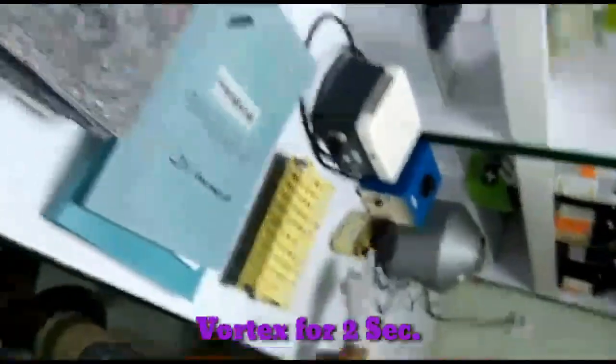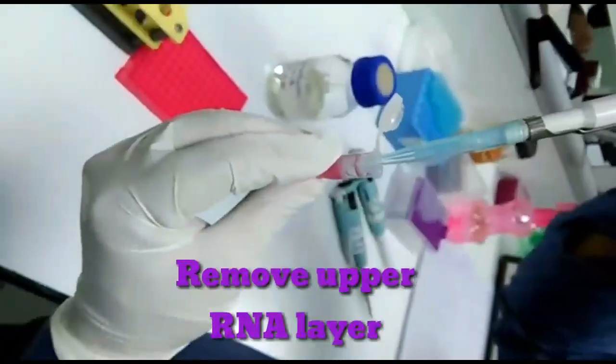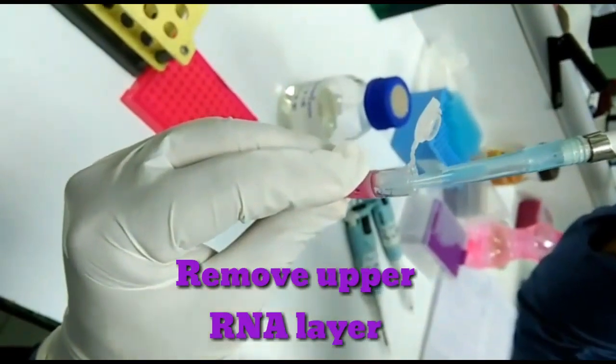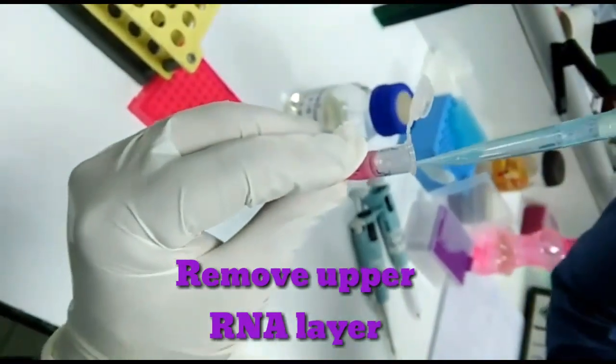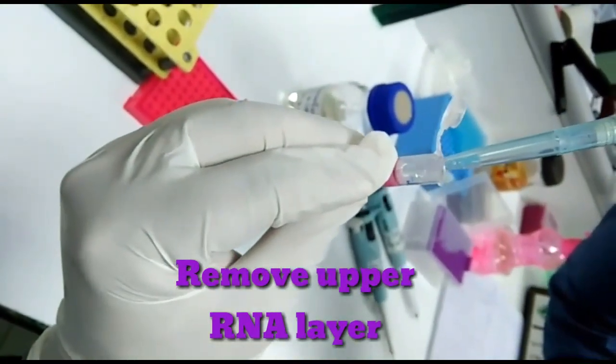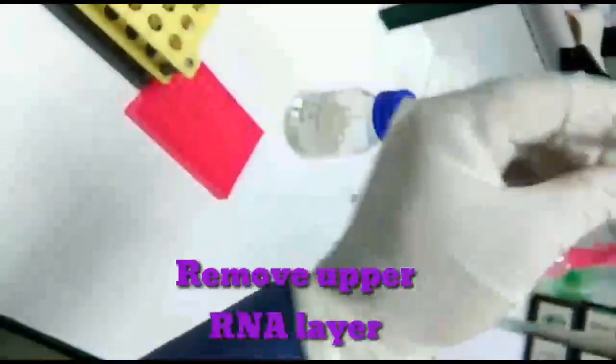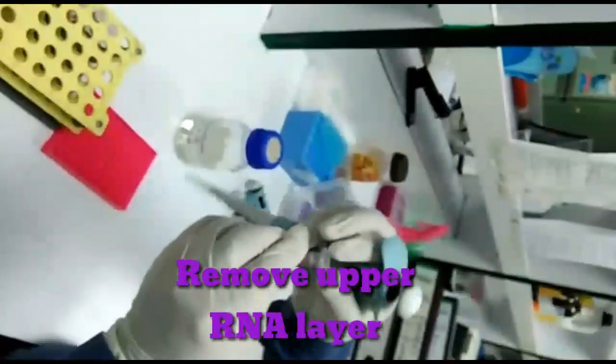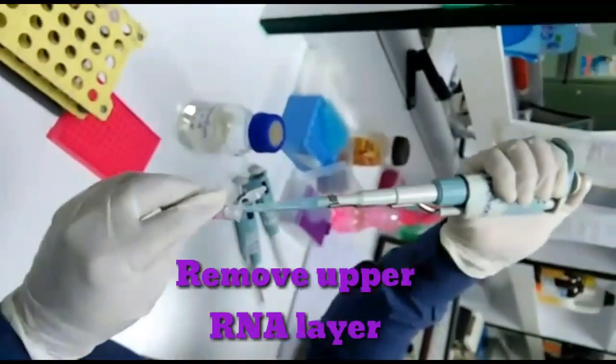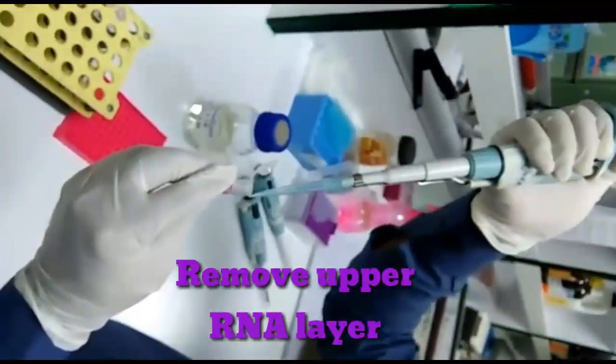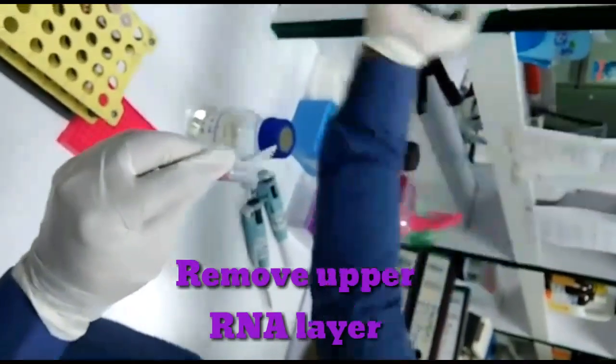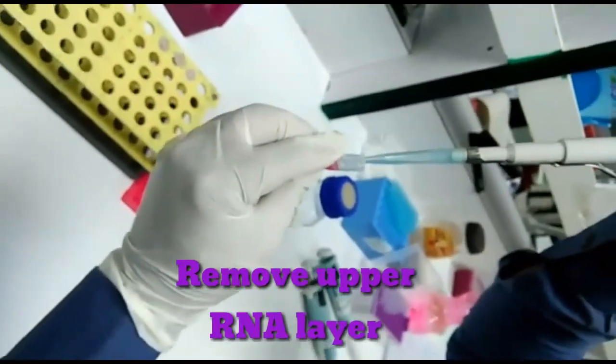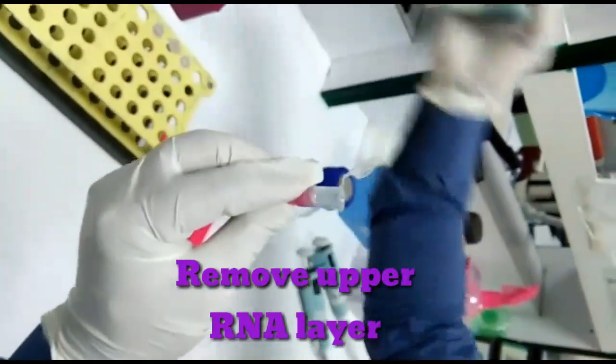After incubation, the chloroform will break the sample in three layers. Remove the upper RNA layer. Here we are removing the upper layer, that is RNA. The middle layer, that is DNA, and the lower layer, that is proteins. Remove RNA carefully from each sample.